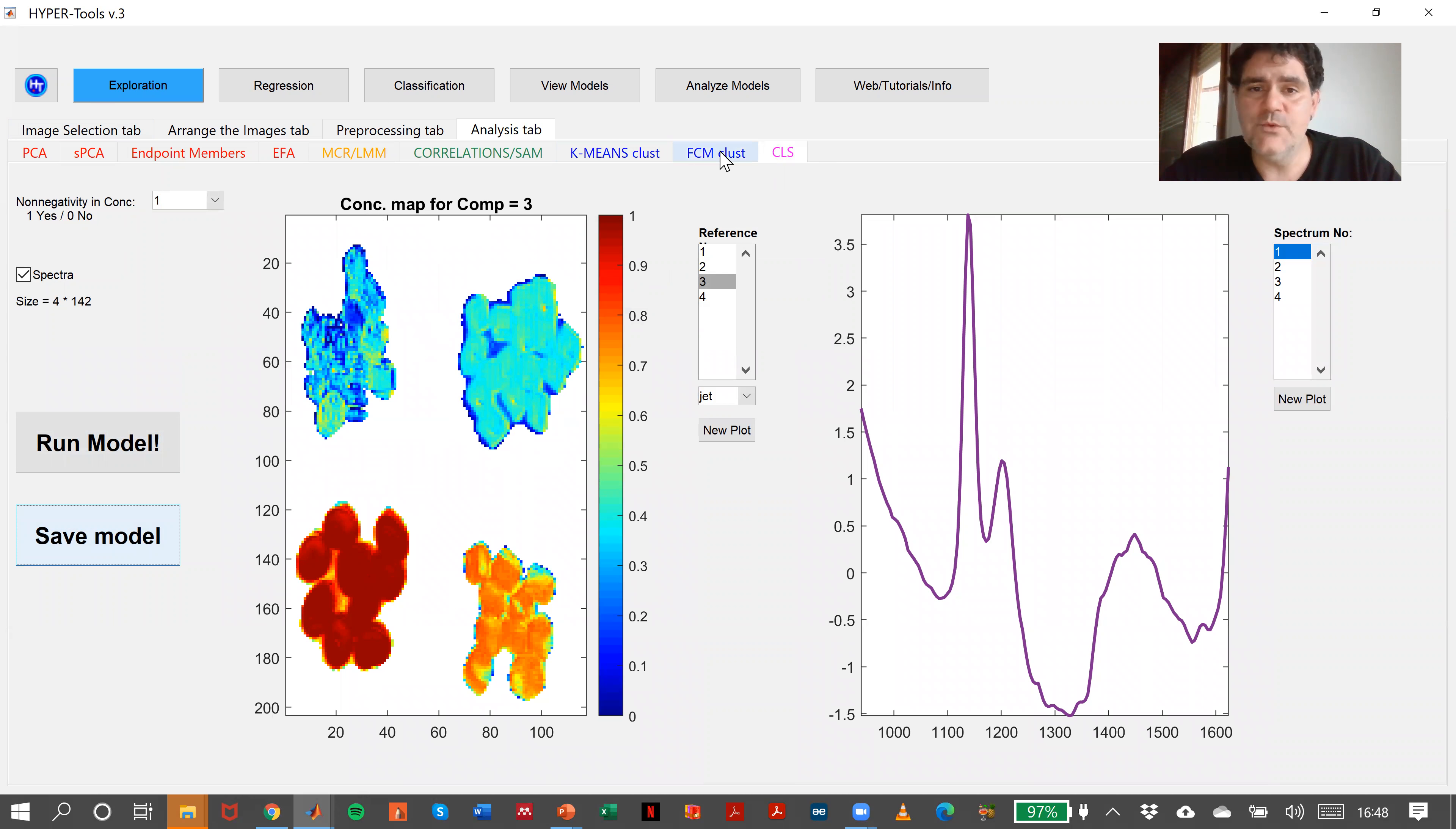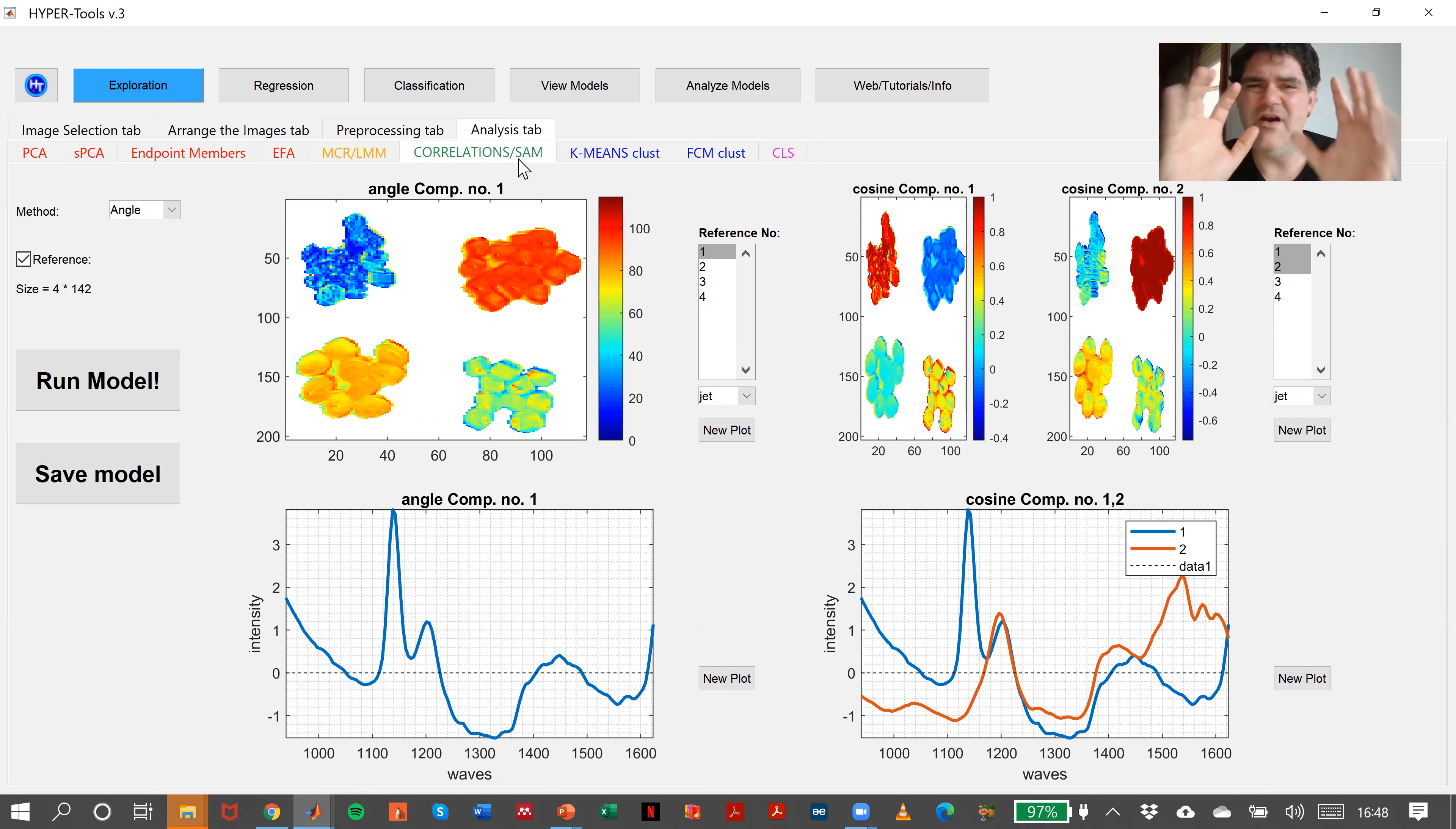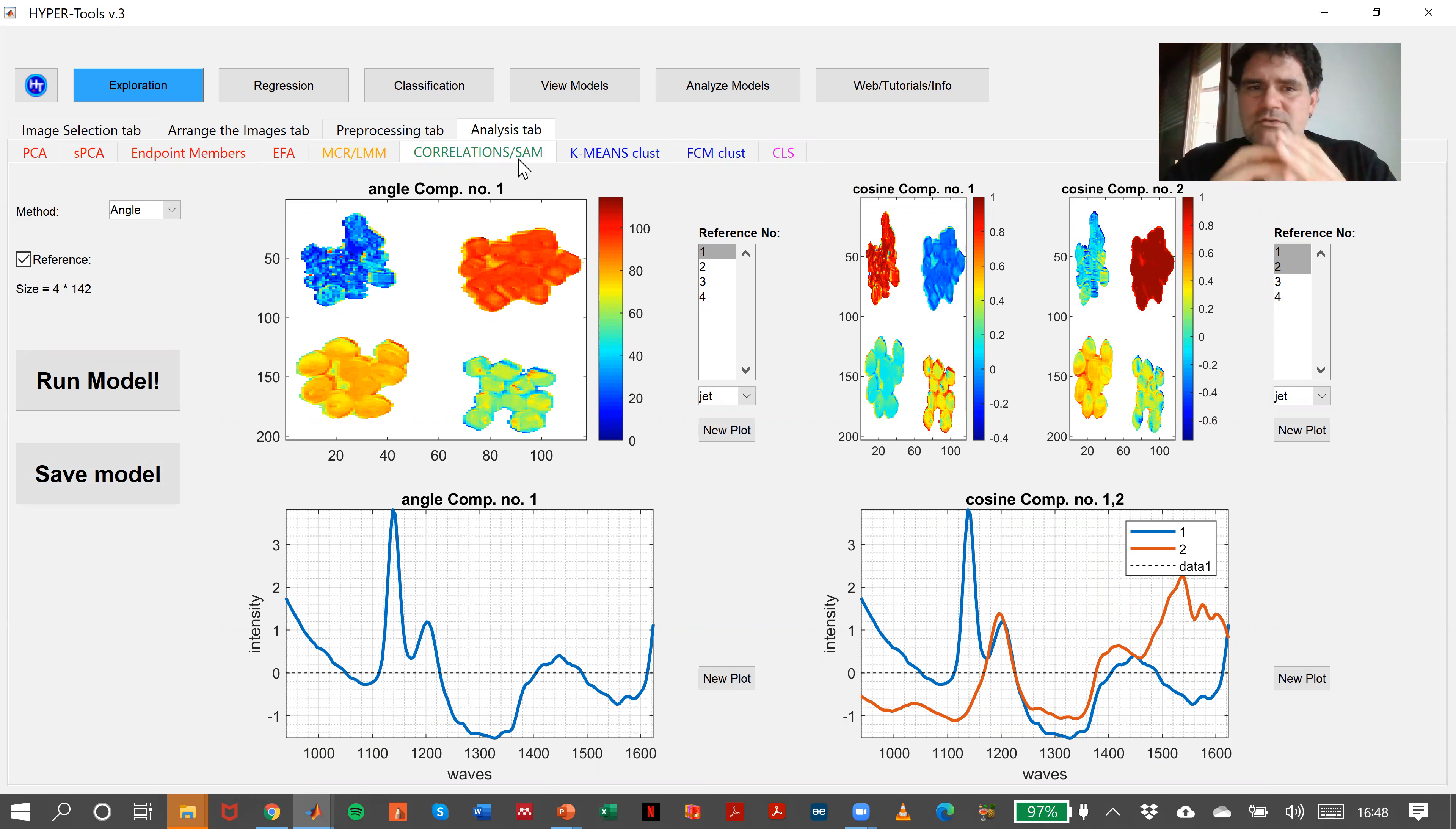With this, we finish the exploration tab. Remember that we can also check what we did before, run models as we need, and save as many times as we need. The good thing of Hyper2 is that you have available all the information or models that you've done so far. This concludes the exploration tab.